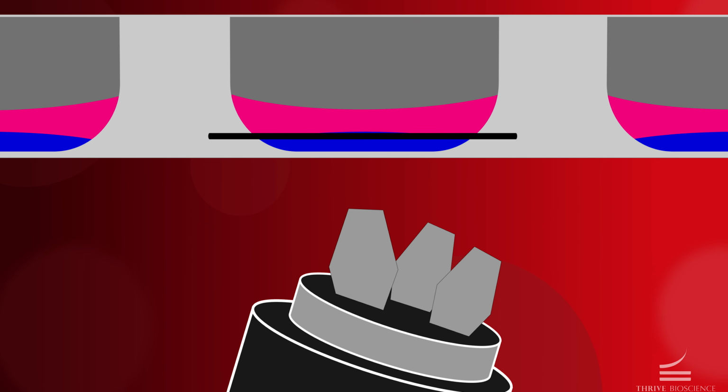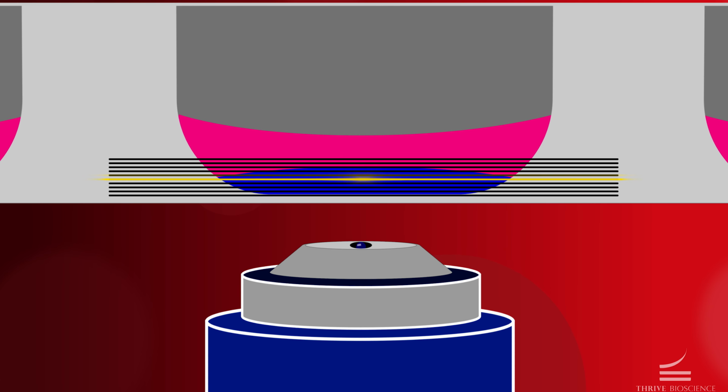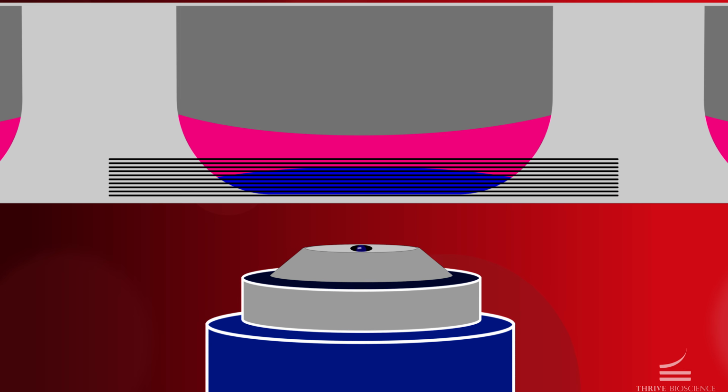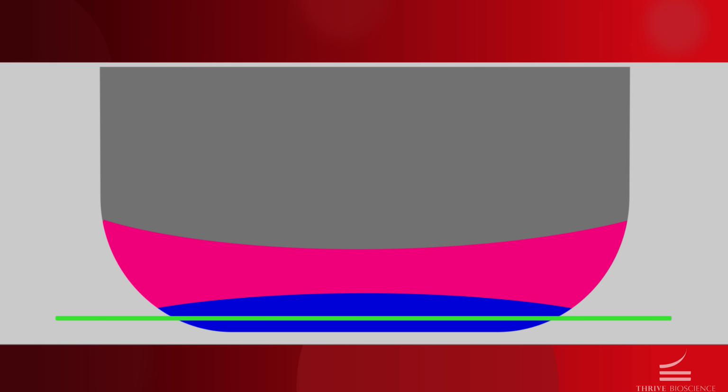With most imagers, you manually focus and take one or just a few best images. CellAssist in minutes captures many hundreds to thousands of images over the plate and at many different focal planes. Then it automatically selects the best images for you, while also saving all of the other focus increments.